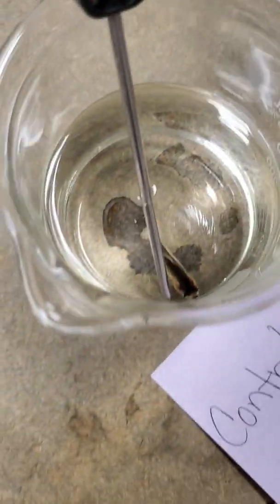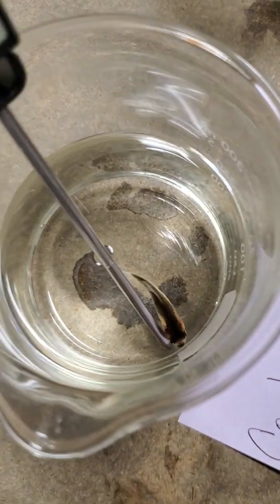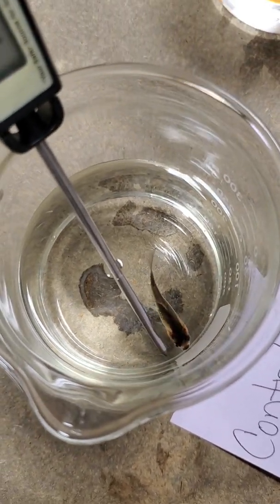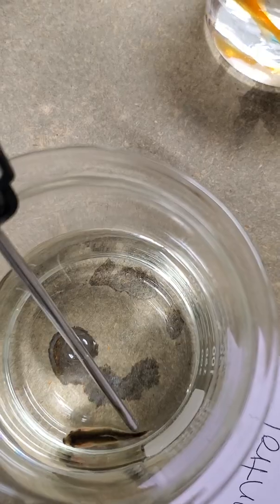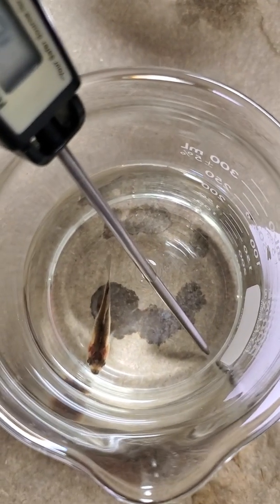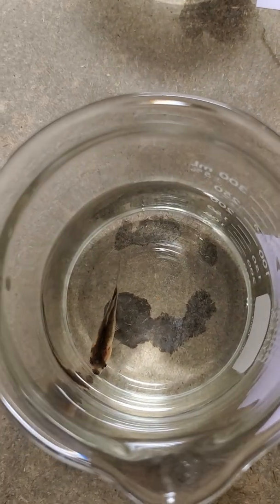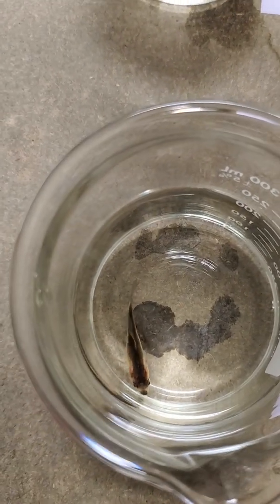Okay, now we're going to move back to our control. Okay, our temperature is 18.1 degrees Celsius for our control, and I'm going to have you start counting his breaths now.